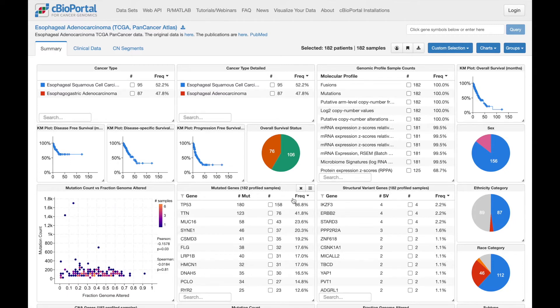As we continue looking, we can see this table which summarizes the mutation data. It shows us the most frequently mutated genes. We can see p53 is mutated in 158 samples, or 86.8 percent of the cohort.